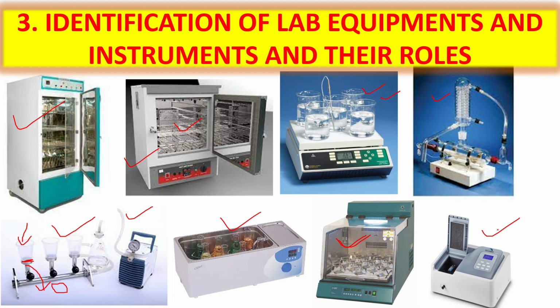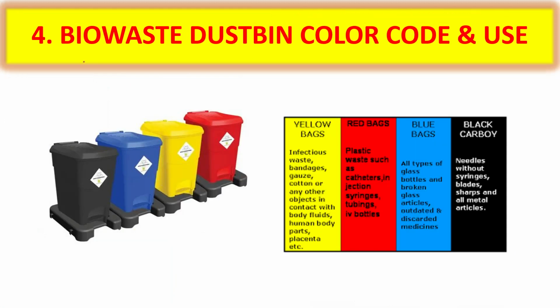Okay, so for microorganisms, we can evaluate their growth by their OD value through this spectrophotometer. Okay, so next thing we will see is the bio-waste dustbin color code and use. In every biological lab, different bio-waste is generated, and for different bio-waste, different colors are given.